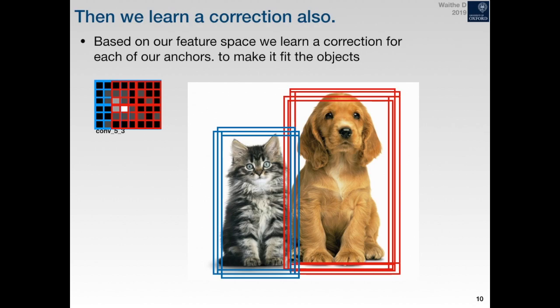And if we have a bounding box which is not so regular, then it takes a lot of time to sort them and make sure that they're not overlapping and things like that. So although it is just a rectangle around what we have, it's very fast and it's very powerful for the classification. So those are sort of the limitations of it, but also the reason it works so efficiently.